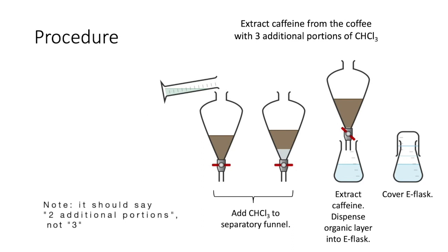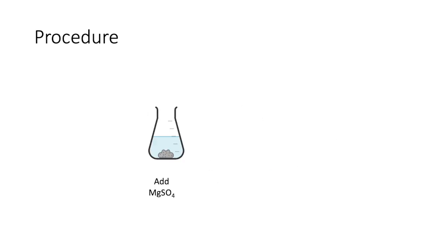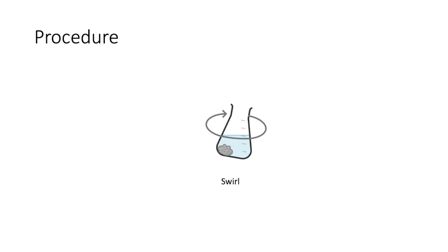Then perform 2 more extractions using 15 milliliters of chloroform each time, and combine all of your chloroform layers into that same receiving container. At this point, your chloroform extracts will be contaminated with a small amount of water. You should dry your chloroform solution by adding a small scoop of anhydrous magnesium sulfate and then swirling. If the magnesium sulfate does not clump and stays loose, you've added enough magnesium sulfate and you've successfully dried your chloroform extracts.